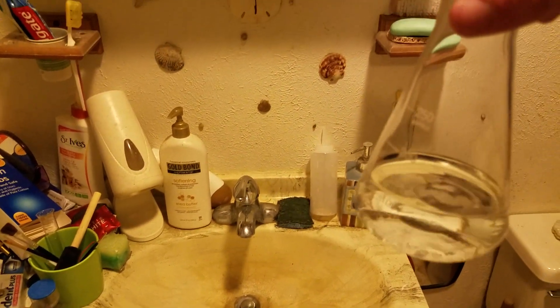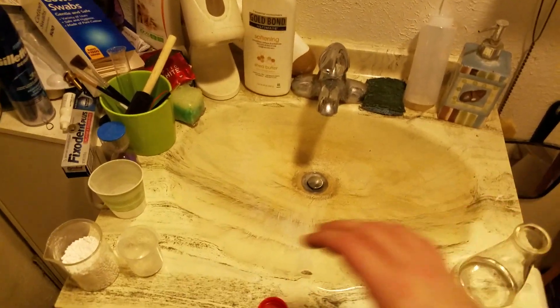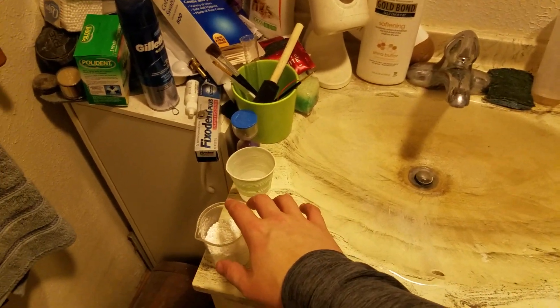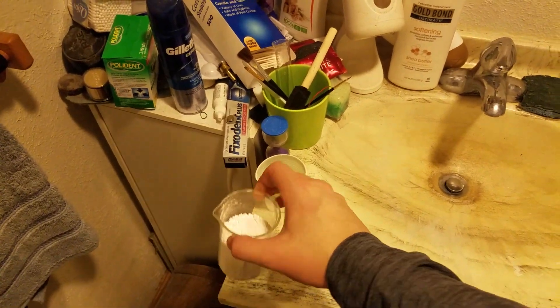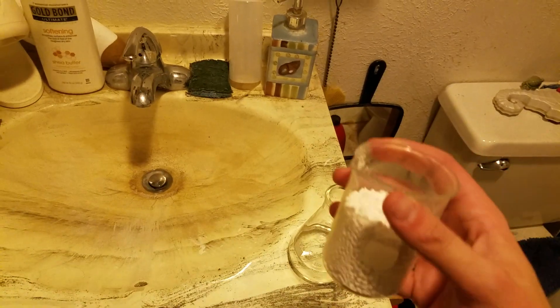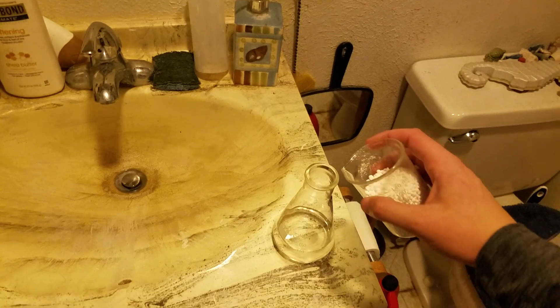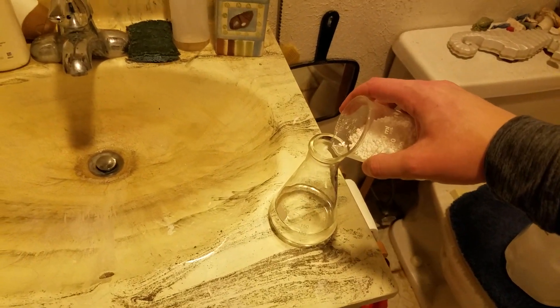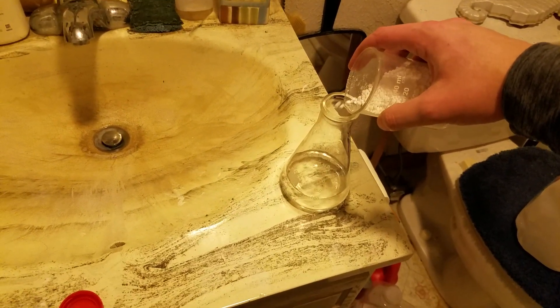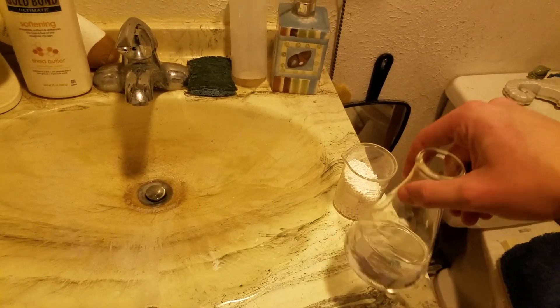So what we got in here is about 100 milliliters of distilled water, and this is calcium chloride. They sell this as an ice melt. You want to get pure calcium chloride — which is what this is — not the calcium magnesium chloride blend. You're going to slowly add this to water because it's going to generate heat.